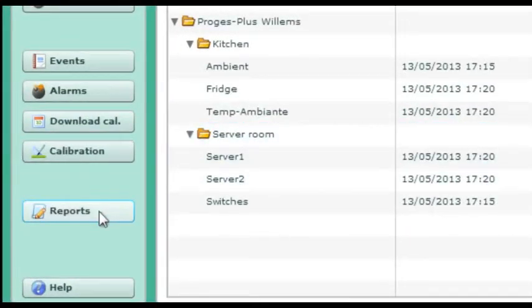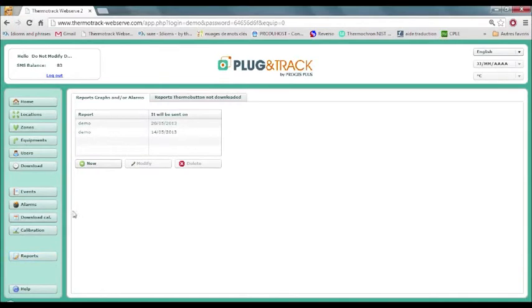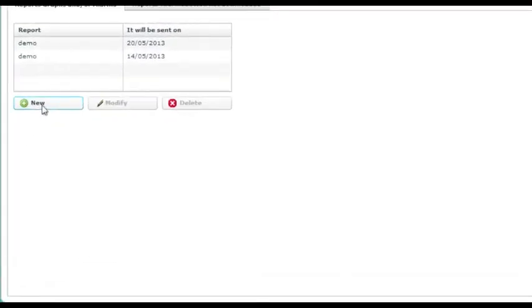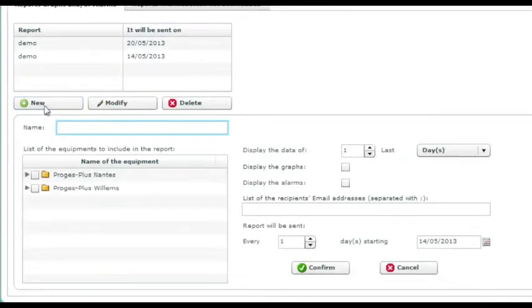Finally, you create reports which will be sent to you regularly as PDF by email. You can create as many reports as you need.